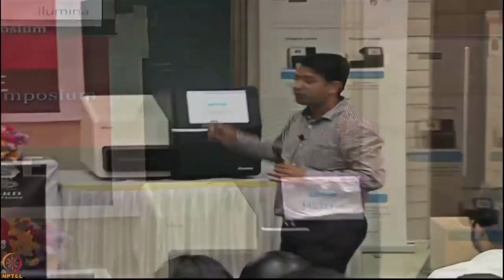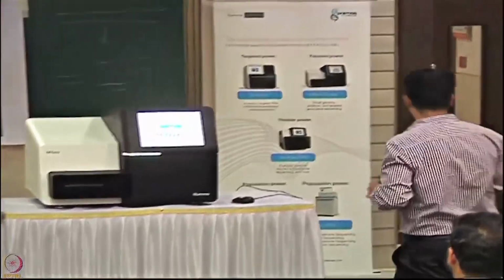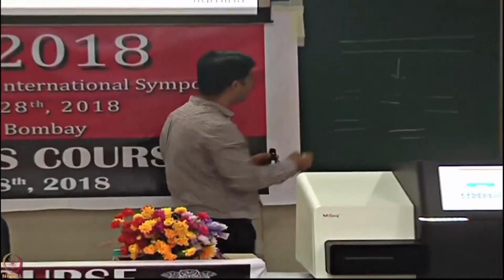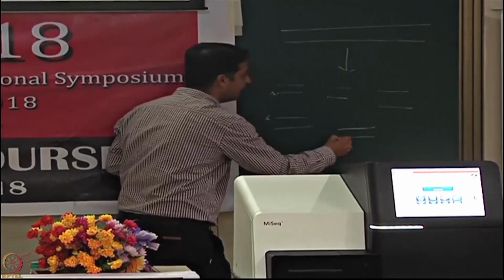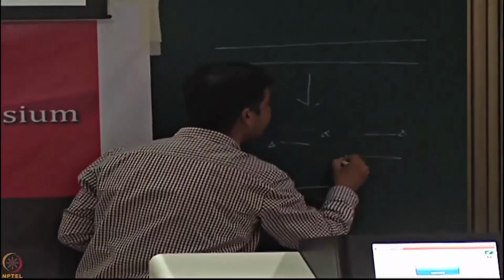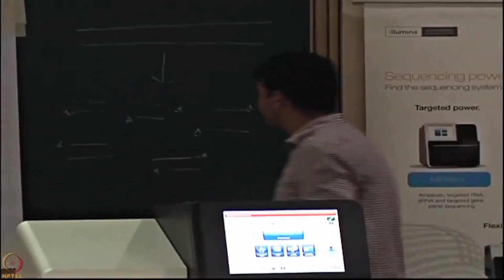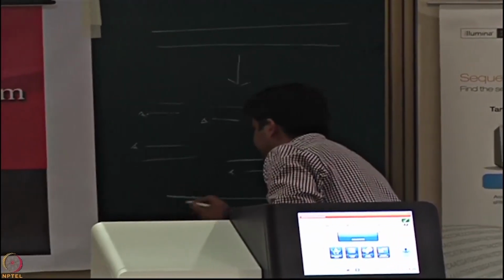Right, you remember now. So initially we will use a polymerase. The tendency of polymerase is, if you have these many fragments, initially we convert all the ends into blunt ends, and you add a polymerase. The tendency of polymerase is it will add an A to all the ends, right? And then we have adapters which contain a T overhang. There will be a simple ligation step. So those fragments will be converted into fragments ligated with the adapters.